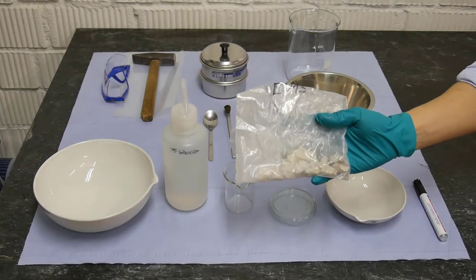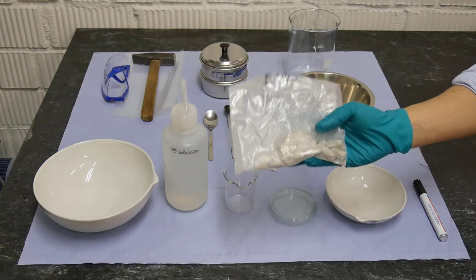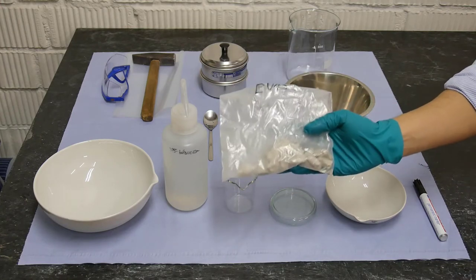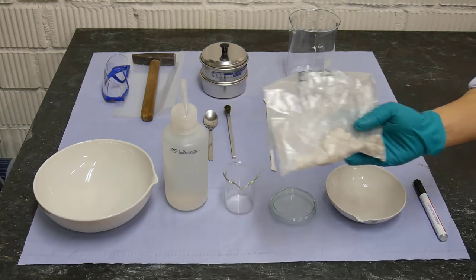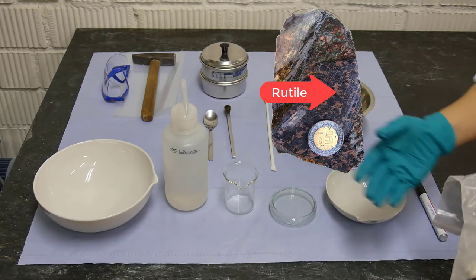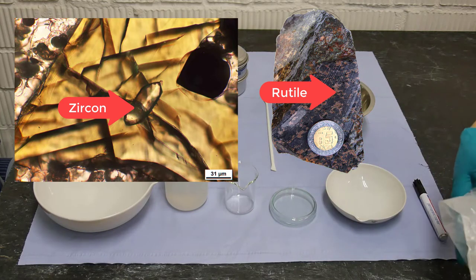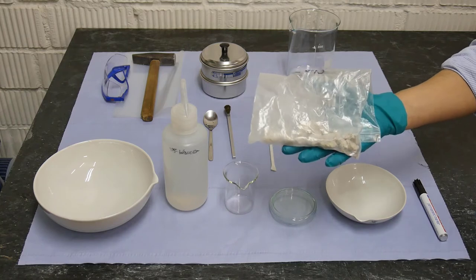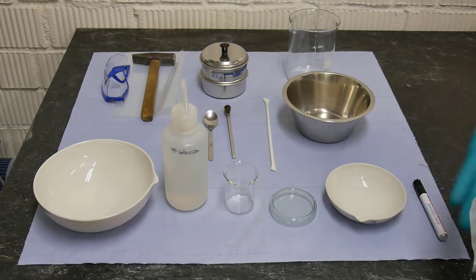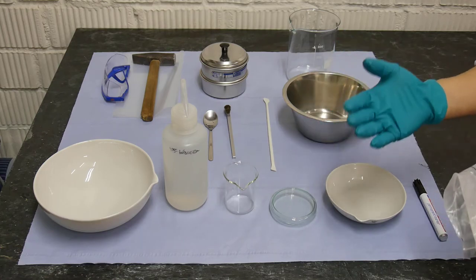One of the most asked questions is: how much sample should I use for mineral separation? Well, this depends on the mineral you are targeting to separate. If the mineral you want to separate is very obvious in a hand specimen sample or in thin sections, then probably you don't need too much material — just some pieces of the rock. But if the mineral you are targeting is not obvious even in thin sections, then you would need much more material, maybe up to kilograms.